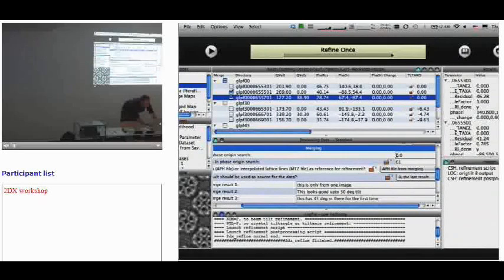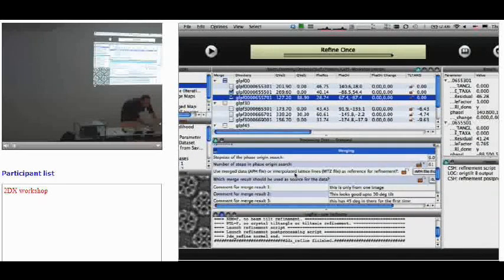So we are aligning this, in this case, with 61 steps of 6-degree step size. So we are searching the entire unit cell. And what these are is something I don't have the time to explain now. But you would take these other 2 images and align them to the first one. And now the phase origin values for these 2 images here have changed by these values, by 90 degrees and 45 degrees, 54, and 72 and 84. So they changed, these 2. And now hopefully these 2 are aligned to the first one, the reference.